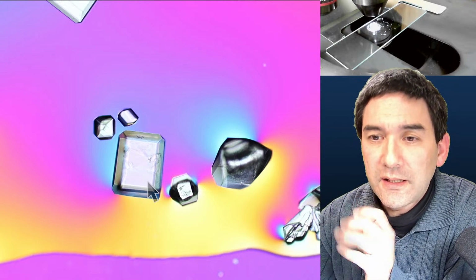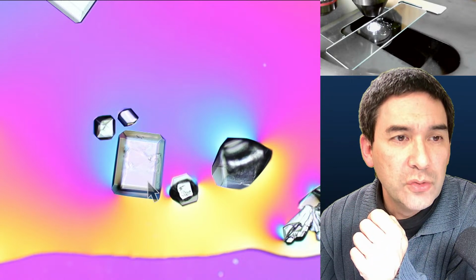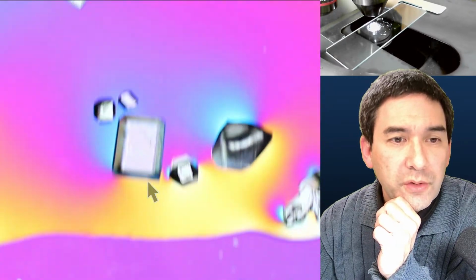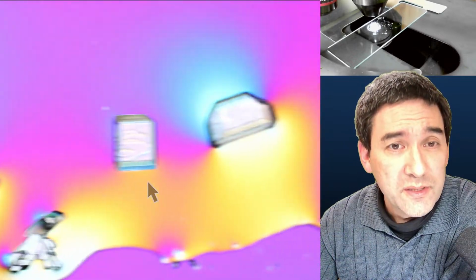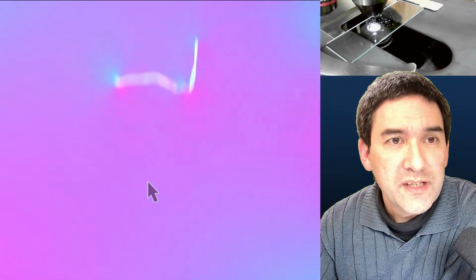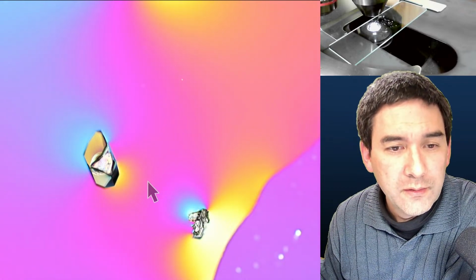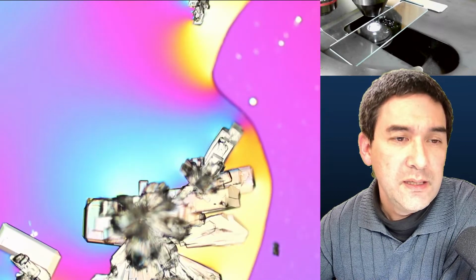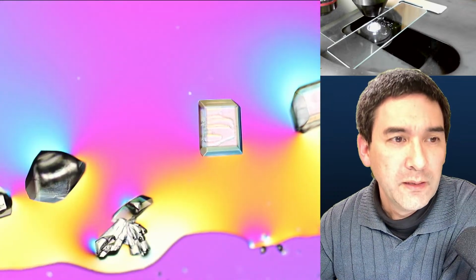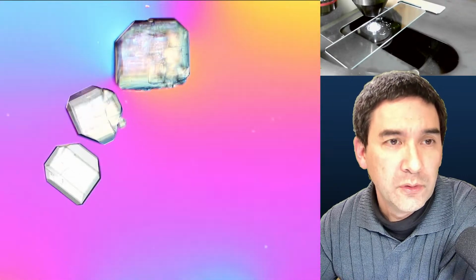Okay, so this is quite an interesting thing, and maybe if we just continue to watch this a little bit here, we can actually see that the crystals do start to slowly grow. Because just a few minutes ago they were much smaller, right? So this is actually something that I've also done in the past. Do some time-lapse videos, and usually when the substance is depleted, then the crystallization process, of course, stops. Okay. Let me turn the arrow off again. Okay, really nice things. But again, what I'm demonstrating here is, as I say, off the cuff, a little bit improvised. And if you try to optimize the conditions, you can get really beautiful results.